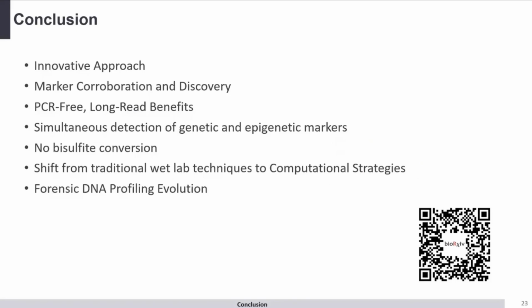However, we did a benchmark analysis to evaluate the overall SNP calling performance using all the SNP loci found within our target regions, and it shows a great calling performance with the HG002 sample against the Genome in a Bottle, a ground truth. Importantly, no bisulfite conversion is involved as we sequence the native DNA harboring the base modifications.